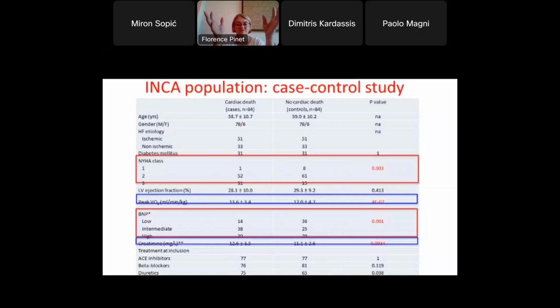So we were comparing. It was a case control study. It was a retrospective study, but we paid attention not to recuperate hemolysis samples, and we checked the hemolysis with a spectrometer. As you can see, the people were very young, less than 60 years, and so we compare. We decided to perform a comparison between the patients who died 3 years after their hospitalization and the patients who didn't die after 3 years.